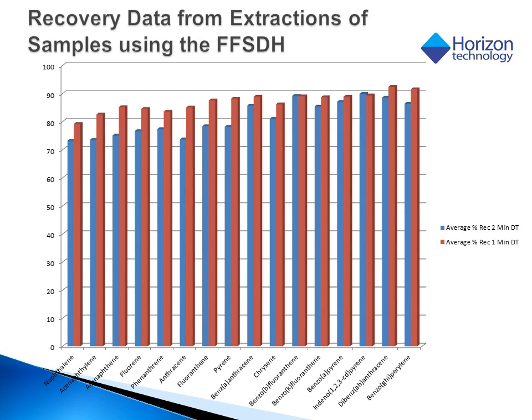The same data is shown here graphically for highly particulated samples. In these experiments, the air dry times of 1 minute and 2 minutes were compared. And using the fast flow sediment disc holder, it is necessary to use an air dry time that gets rid of most of the residual water. However, care must be taken that too long an air dry will also decrease recoveries of the more volatile components like naphthalene.